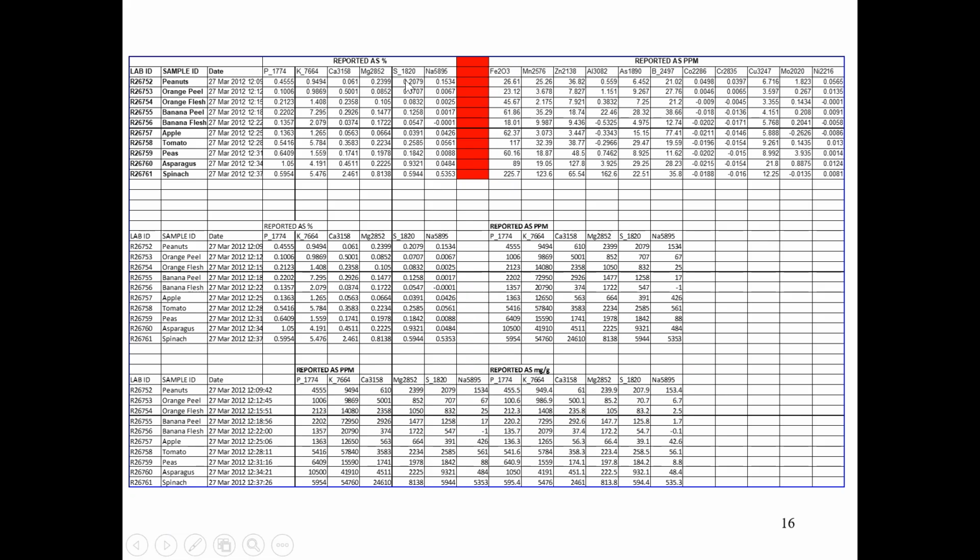No, it's right here. It's looking at you here. That's angstrom. Oh, divide by 10. 182. Compare these other ones, 286, 315, 766. Those are in the visible and UV light. These are in the visible region, while sulfur and phosphorus are not.